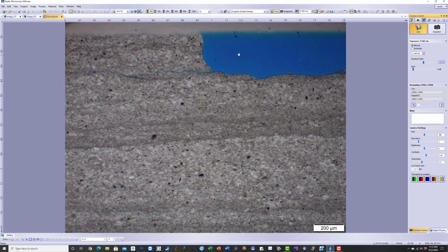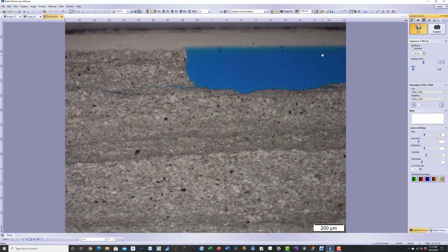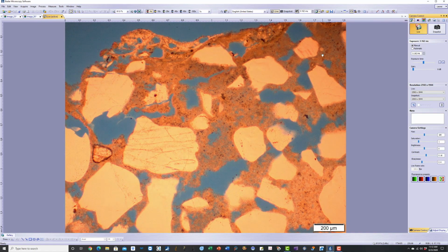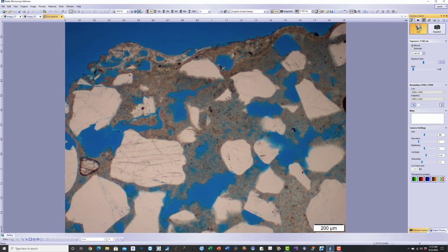The problem in this particular paver is splitting or scaling of the slate paver, especially adjacent to the jointing mortar. Here you can see a portion of the slate that has flaked off right adjacent to a jointing mortar, which is right here. You see how the light came back by auto white balance adjustment. The light was bright red and then slowly it came back to the natural color.